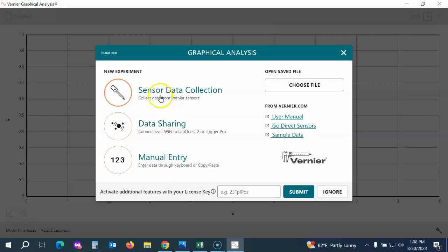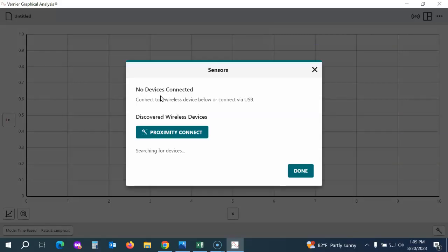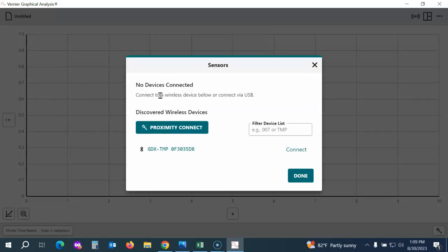Your first thing to do is to click Sensor Data Collection. Now the probes, after you power them on, will flash red. If they're flashing red, that means they are powered on but not connected to a student device. Select Sensor Data Collection and your computer will scan for sensors that are within your proximity.